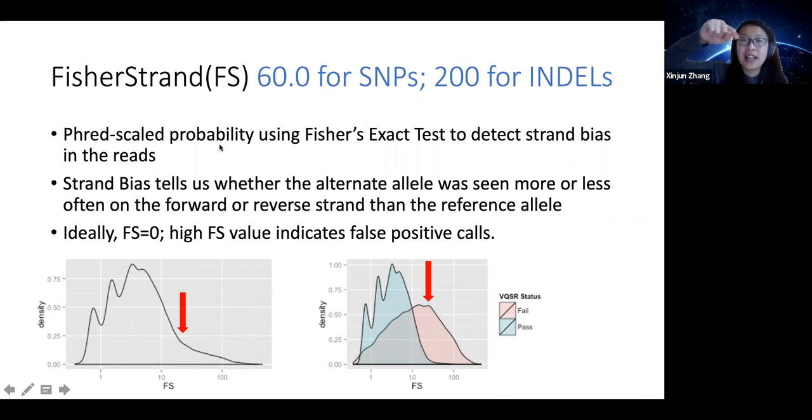If you look at each genotype, at first you have the genotype, you have read depth, maybe an allele balance, and eventually we have a Phred scale probability, a log scale probability of how likely this site is to be reference homozygous, heterozygous, or alternate homozygous. The one with the lowest score, which means it has the highest probability, is the one that we assign the genotype for.